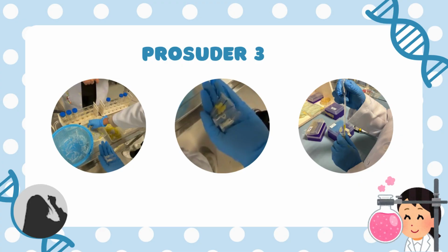Let's move to practical 3. In practical 3, we are given five materials to do this practical. First one is microcentrifuge tubes. Second one is dropper. Third one is distilled water. The fourth one is toluene. And the last one is the three selected lipids. In this practical, the selected lipids that have been given to us are the best of food, which are vegetable oil, shortening, and butter.